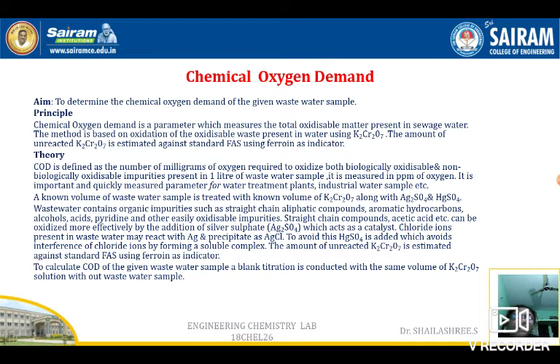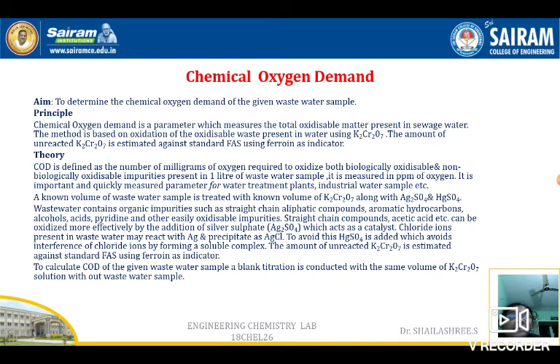When we add mercuric sulfate, the chlorides present will react with the mercury and form mercuric chloride. And to determine the total amount of COD of the given wastewater sample, a blank titration is conducted with the same volume of the dichromate solution but without using the wastewater sample.